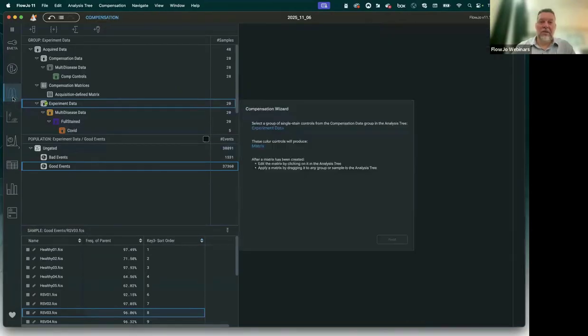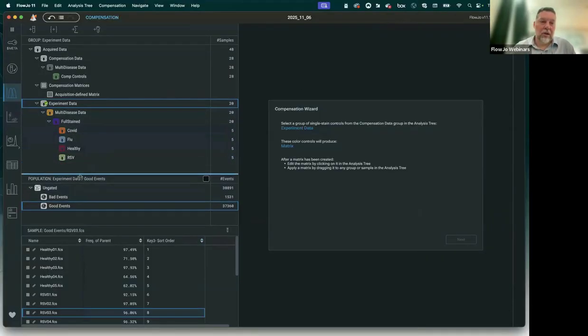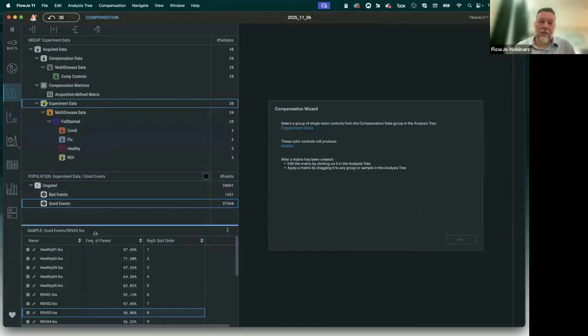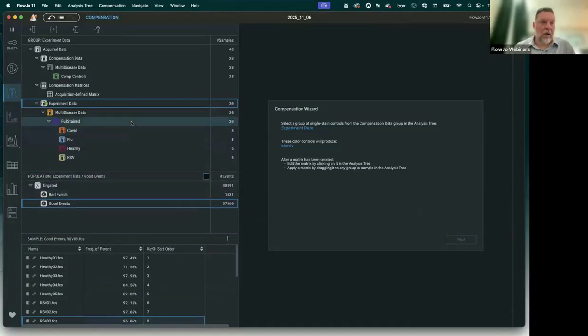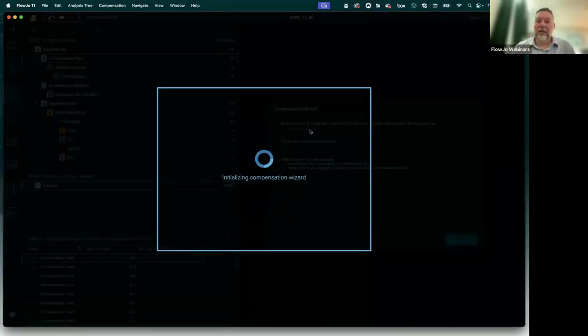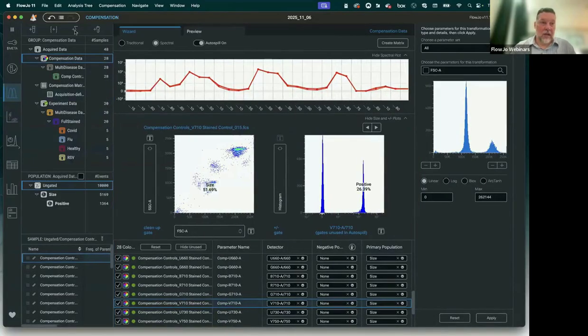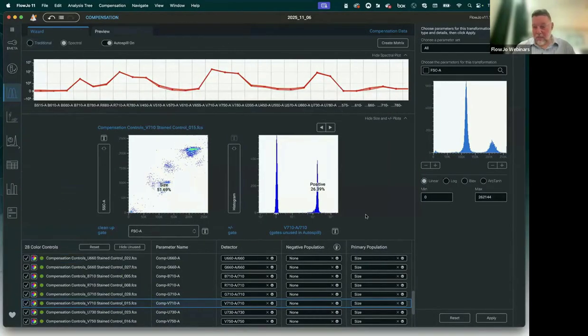All right, so now compensation wizard. Again, I'm going to go fast here because this is just an intro, but come to the next webinar on the 20th or watch it once it's recorded and you will be able to follow along with Giannis showing you everything. Why can't I initiate the matrix? Well, just like in V10, you need to actually focus on the group that has the compensation controls in it before the tool will be available to you. So it says select the group compensation. And there it is. I'm going to minimize over here so you can see more.